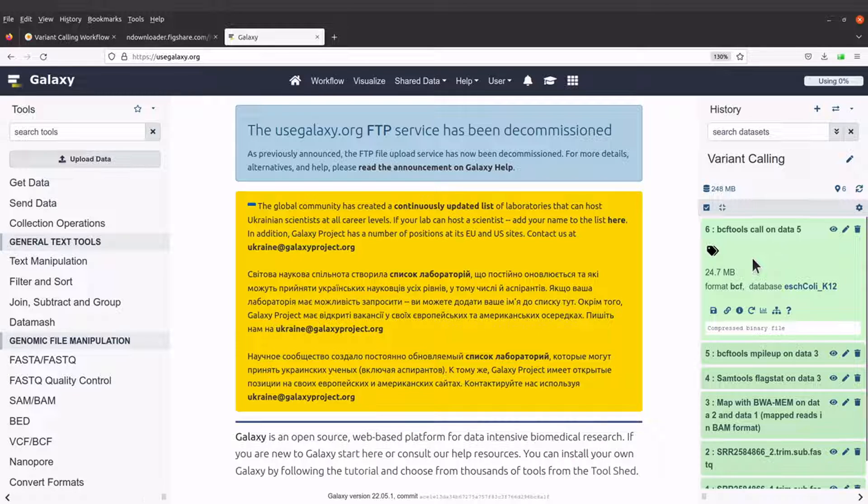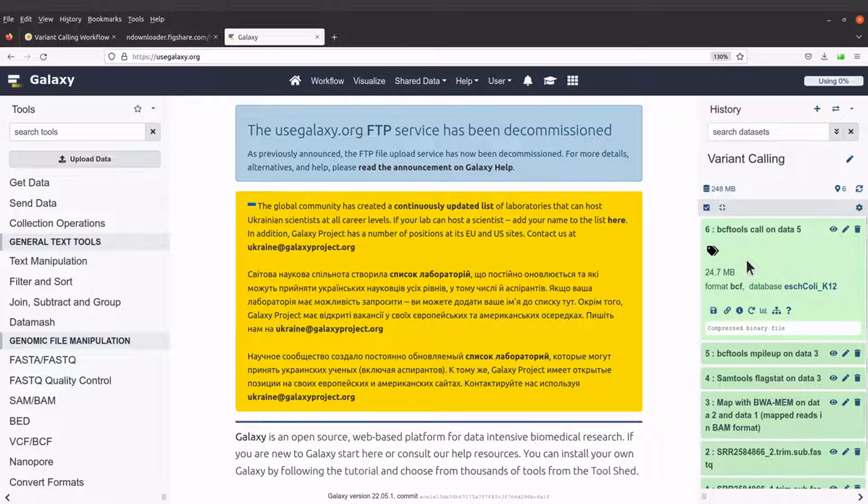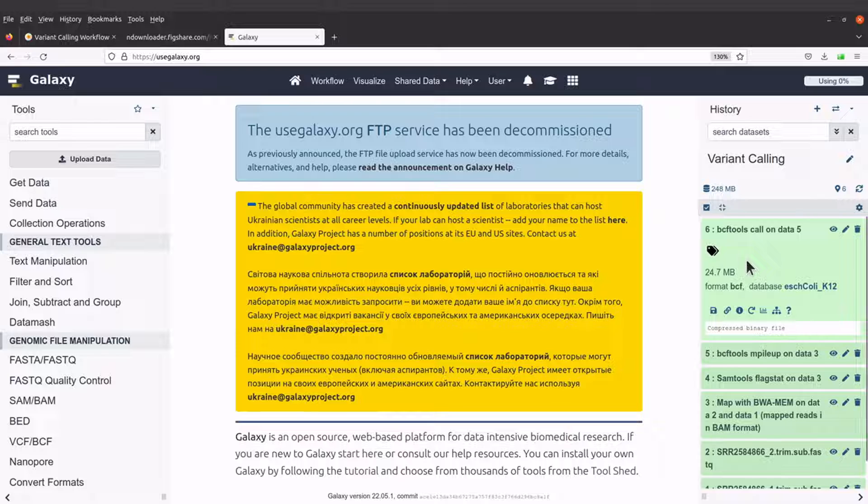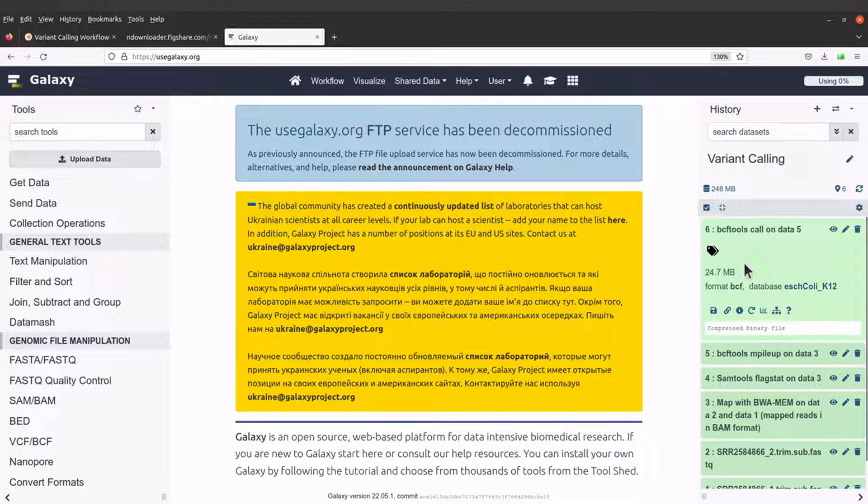The small size is due to the fact that this file has been compressed. Remember, we selected compressed BCF as the output file type and that is why this file has been compressed and this makes it possible for us to quickly download the output file.